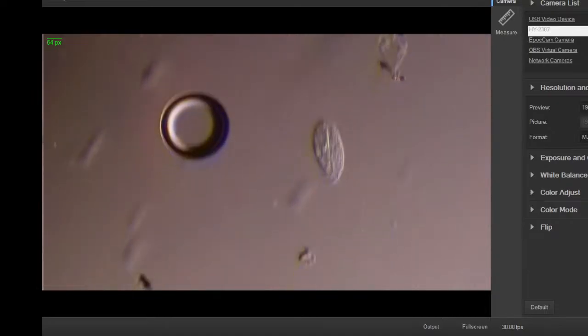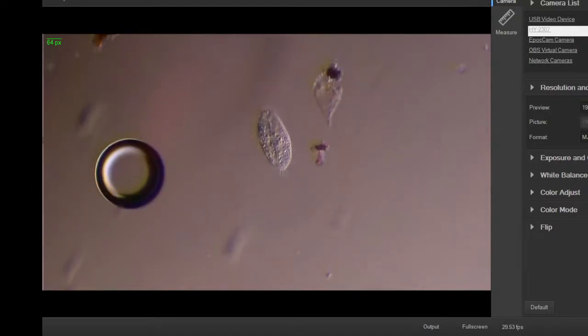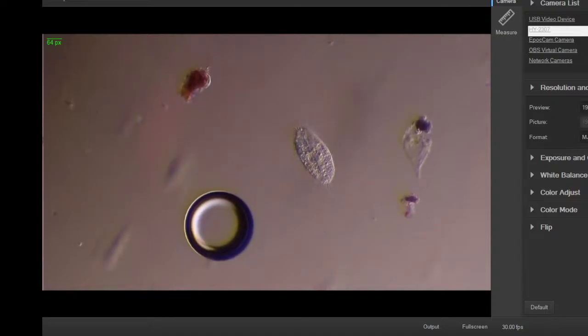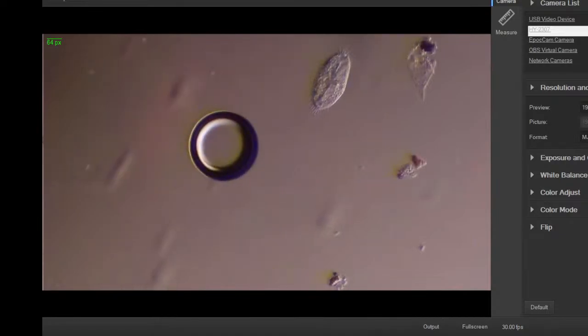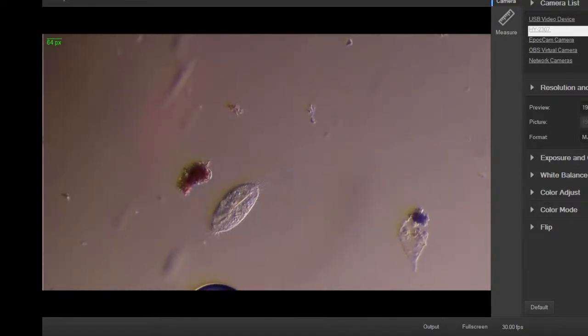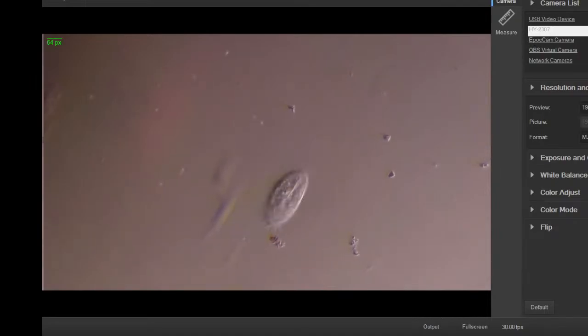So you see less of the particles in this mode compared to the dark field, but you get better contrast and structural details of the cell. Compared to the typical view that I used when I started looking at this character, just a classic transmission microscope, high contrast. If you turn the contrast up, you get the detail, but you lose some of the colors. You put in this little diaphragm for the lighting, but this is so much more interesting when you play with this. Like being a cinematographer, you have all these tools at your disposal, different filters, different f-stops, different lighting levels, and you can really get some pretty amazing shots with just a single microscope with all these different settings.